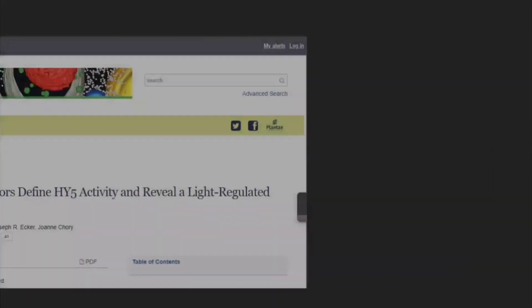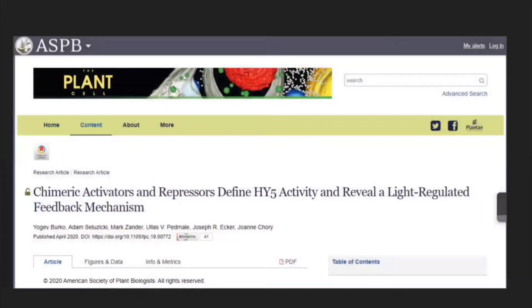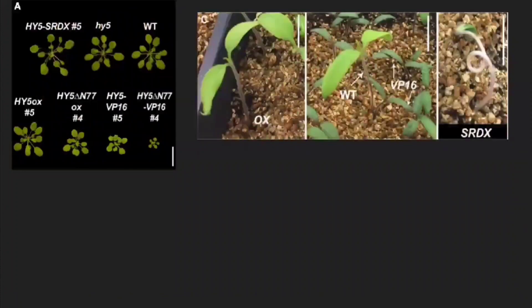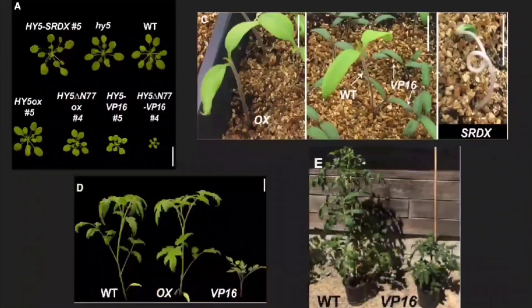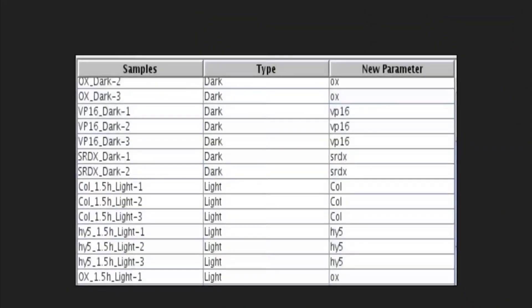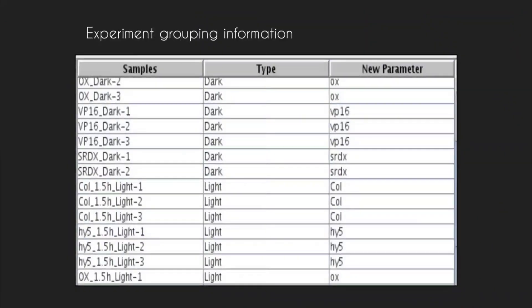Let's move on to the analysis part: the role of HY5 in etiolated plants analysis in Strand NGS. The analysis was done using data from this paper. These are the samples and different conditions used to create experiment grouping information. This picture shows how the mutated plant groupings from the paper and their lighting conditions have been added as experimental groups.